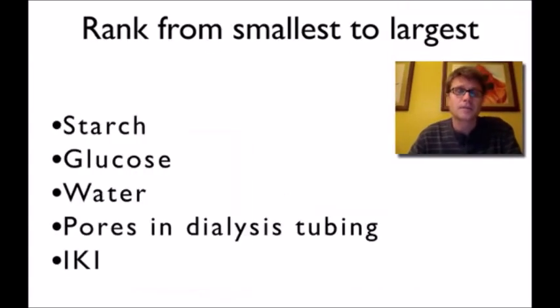And so, basically what you're going to try to answer after watching this diffusion demo is rank the following from smallest to largest: starch, glucose, water, the pores in the dialysis tubing, and then finally IKI, or Lugol solution. So first of all, I should probably describe what all of these things are.